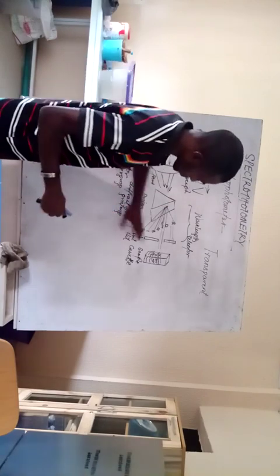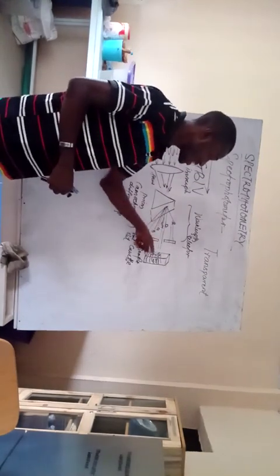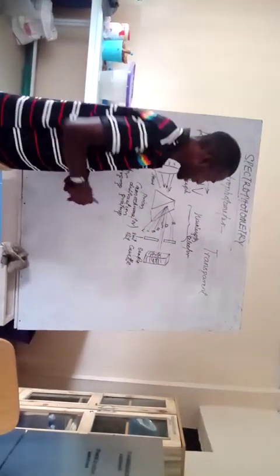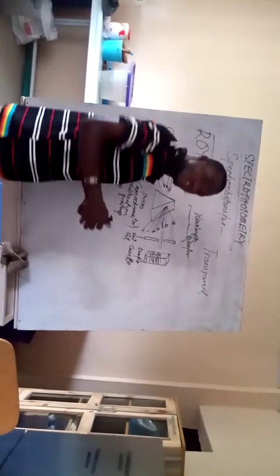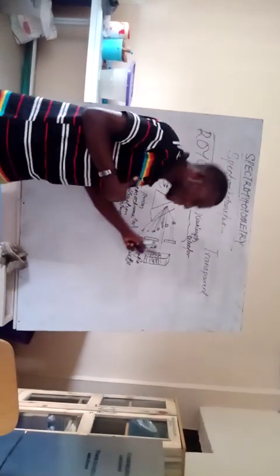The particular wave of light that has been selected strikes this cuvette, and the substance in the cuvette, being translucent, is going to absorb an amount of light, and that property is called absorptivity.